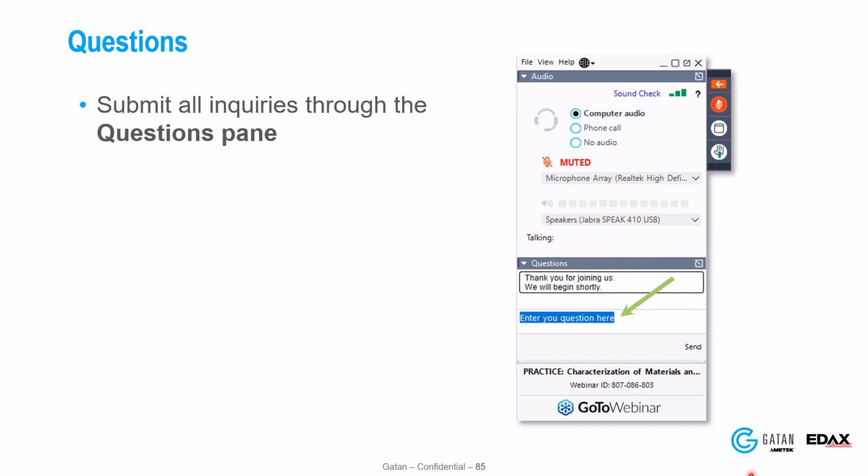The first thing is I'm always saving patterns. We'll probably pretty soon have a setting in the software saying, do you want to save patterns by default? The reason we haven't before is they do get large. When you save the pattern files, you can save them as an 8-bit file to save a little bit of space, or a 12-bit file, or a 16-bit file. I usually save the 16-bit, again, overkill.